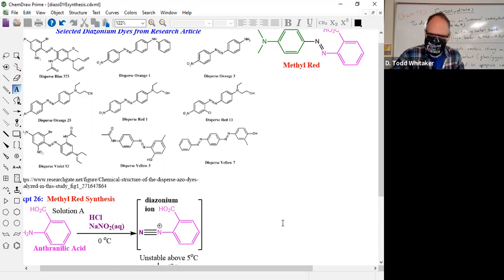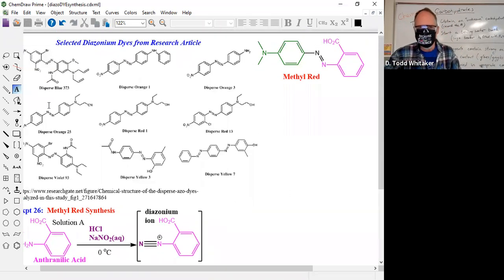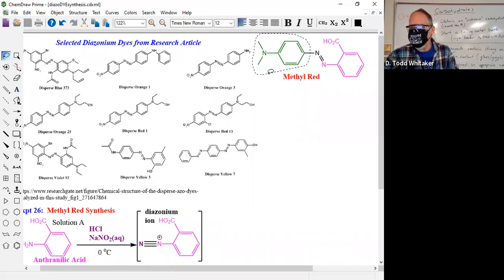It's organic, yeah. We'll talk about sodium acetate in another video, which is already present. Sodium acetate's role is the base to slowly bring the pH up. But the next organic chemical is going to be N,N-dimethylaniline, right?